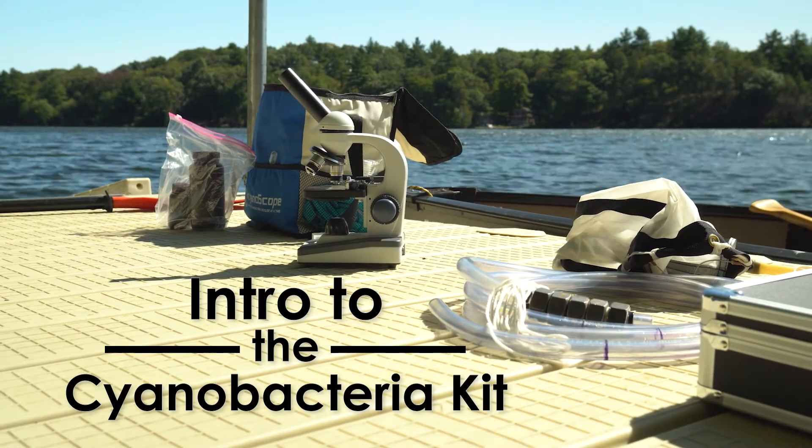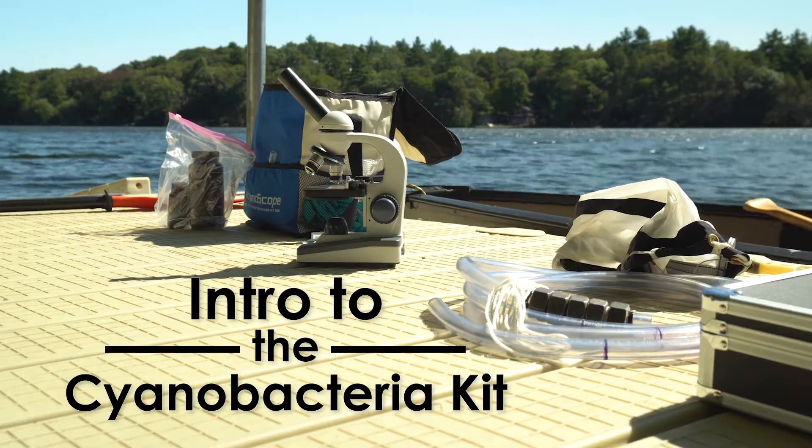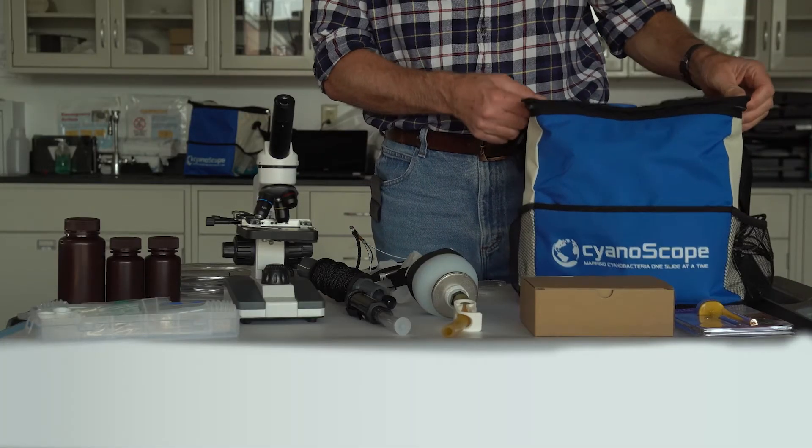This video will introduce you to the Cyanoscope testing kit. The kit comes with everything contained in a carrying case for easy transportation.